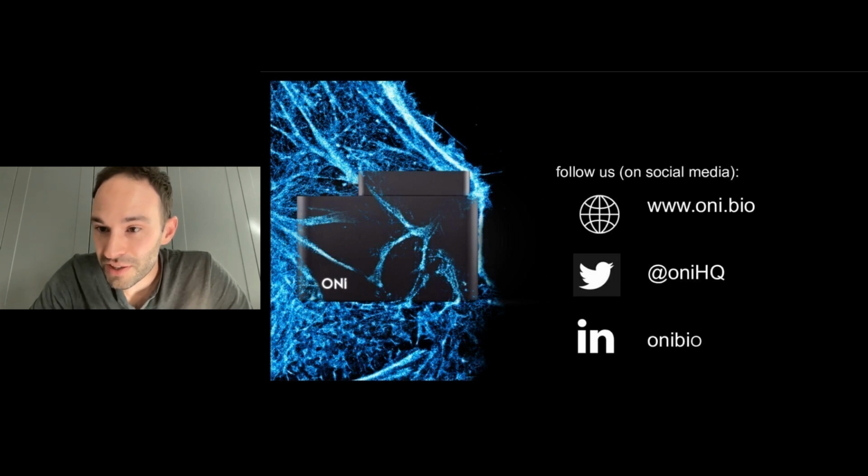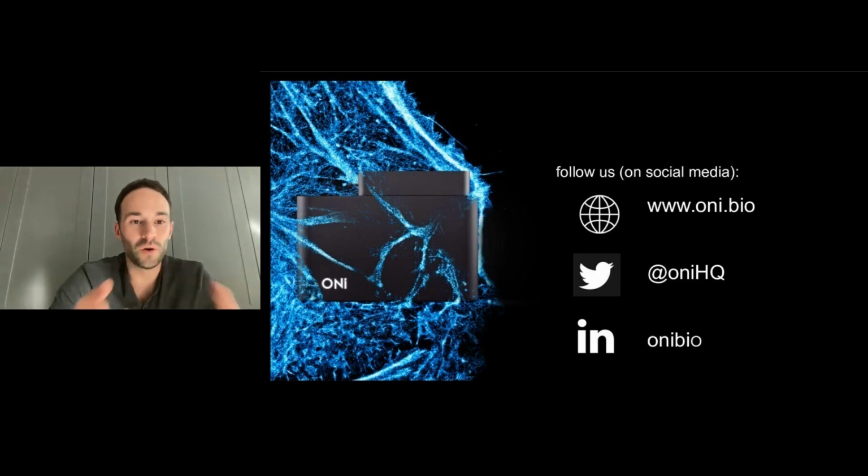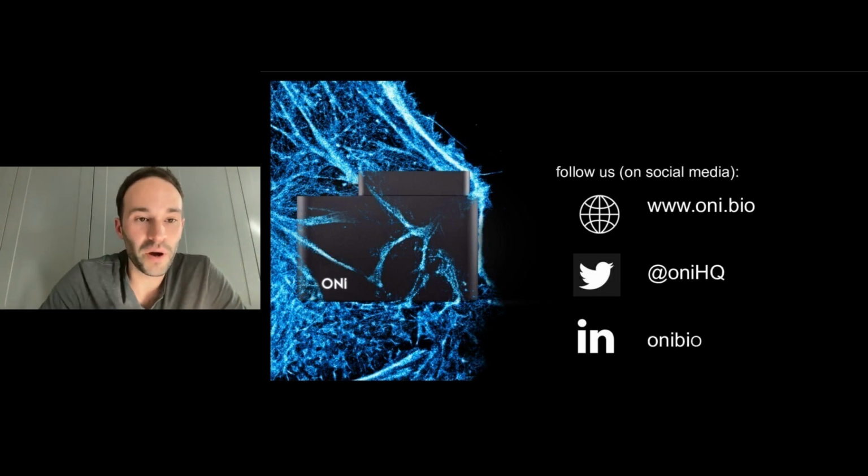And then a question here: I didn't talk much about PALM, and how do you achieve PALM with the Nanoimager? So a quick recap for people who aren't familiar with PALM. PALM is another single-molecule localization-based method, but instead of using spontaneous blinking like you get for dSTORM, PALM uses deliberate photoactivation of molecules using an extra light source, which is generally the UV light source. So you can do PALM on the Nanoimager very simply because it has a UV laser.